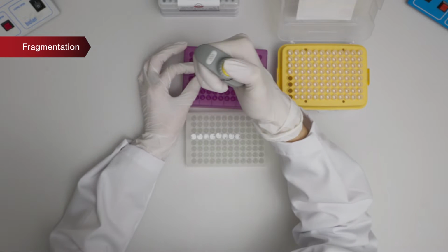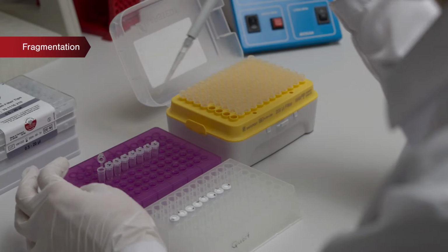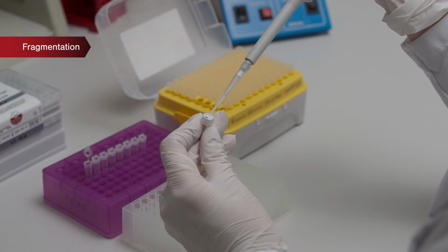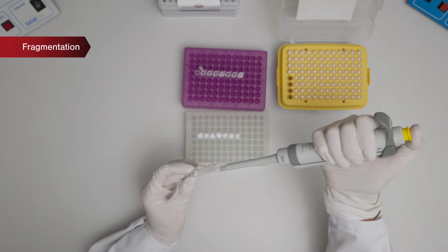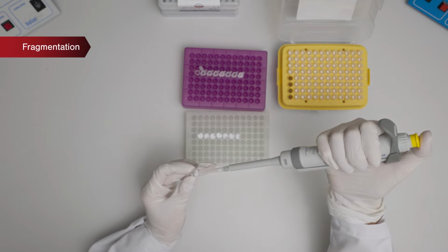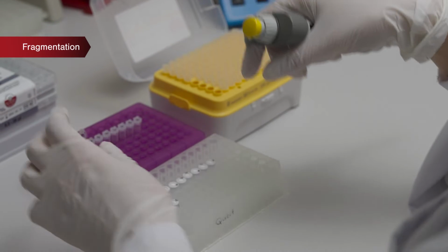Based on necessary sequencing length, the optimum fragment length can slightly vary, but mostly it's 350 to 450 base pairs. The right conditions should be selected for the target length. For 150 base pair sequencing, we use 400 base pair long fragments, so the conditions for sonication are chosen from the table below.